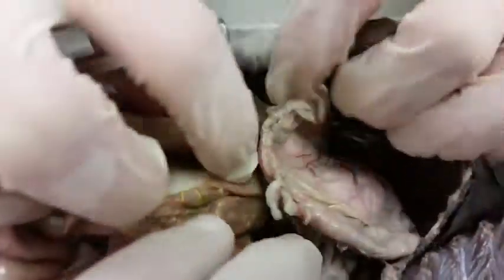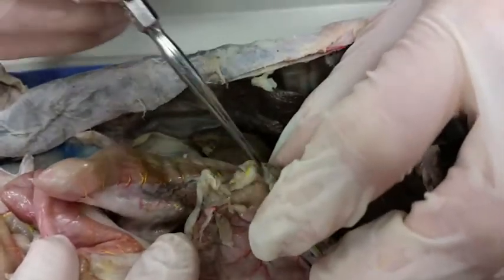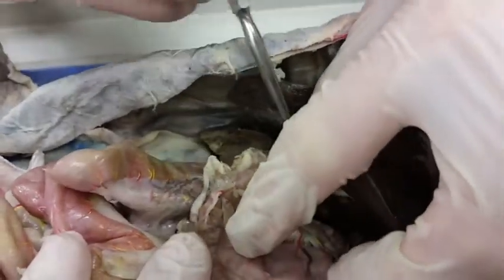Okay. Back down into the stomach region. Right here is where the stomach curves. So the inside curvature into the duodenum is called the lesser curvature. The outside is the greater curvature of the stomach.